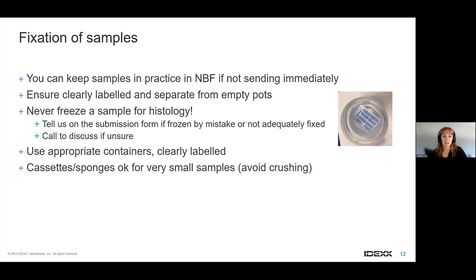Generally speaking, never freeze a sample for histology, because it can create quite a similar artifact to what you've seen before. If the sample was frozen by mistake or for whatever reason, or not adequately fixed, then it's really important to tell us this on the submission form as well.